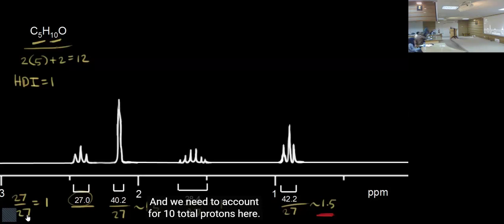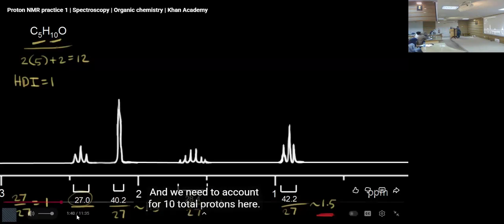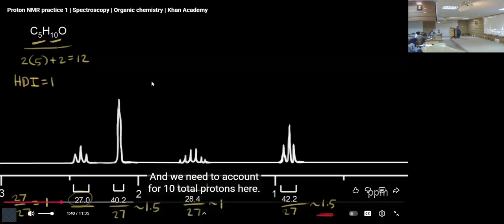What's your question? Yeah, I'm asking about the chiral center. I know the formula, but for my sample, I don't know what the formula is. Yeah. Oh, okay. So that's a good question.